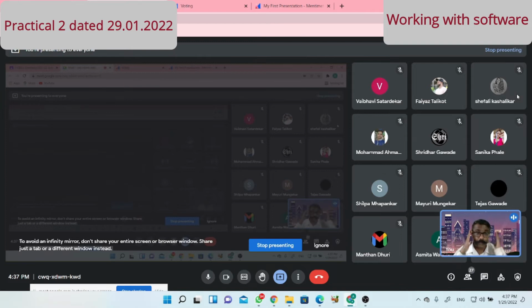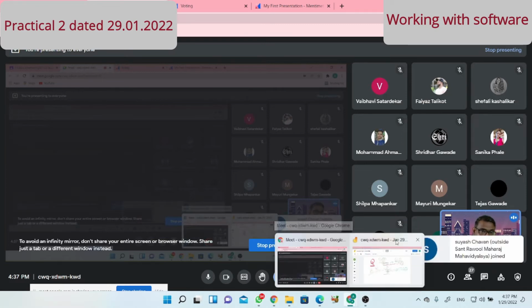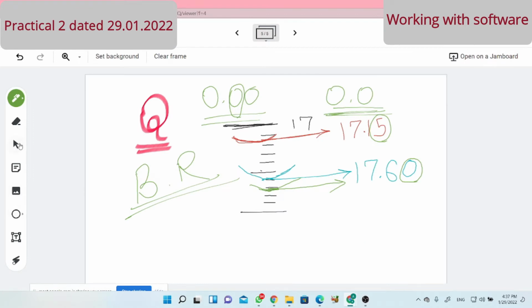But what remains in your mind? Always the initial level should be 0.00 or 0.000. It depends upon the least count of what we expect. That is the rule. And that is removed here in this experiment. They were providing you sometimes 8.25 cubic centimeter as an initial burette reading. So I think about the burette reading you don't have any problem. Am I right? Yes, sir.